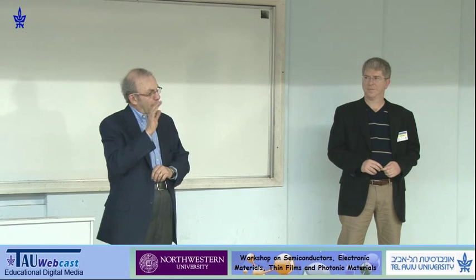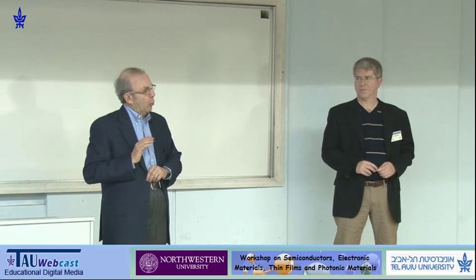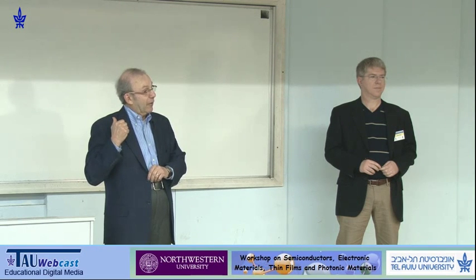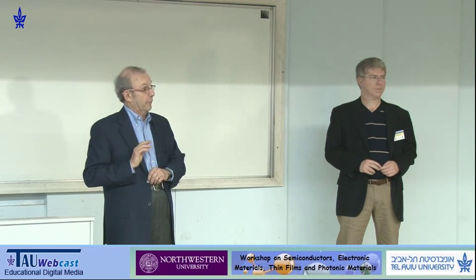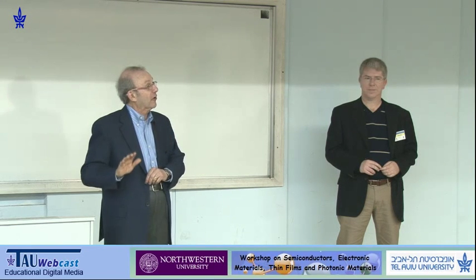That figure sticks in my mind. And then we went up to Imago with some specimens of hers. It was then called Imago. And in one day, in one afternoon, with a prototype LEAP, it was an alpha version, we collected more data than she had collected in her entire PhD thesis. So once we had the LEAP in the laboratory, no student would touch it.